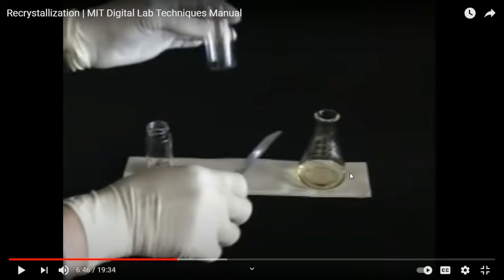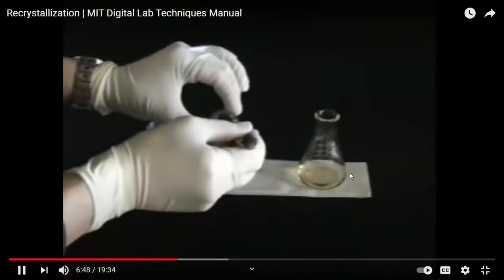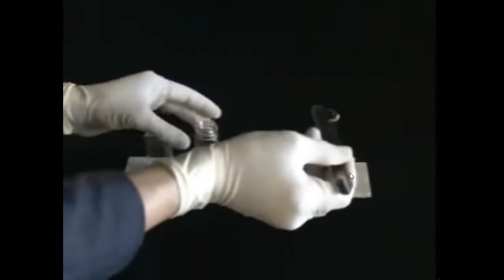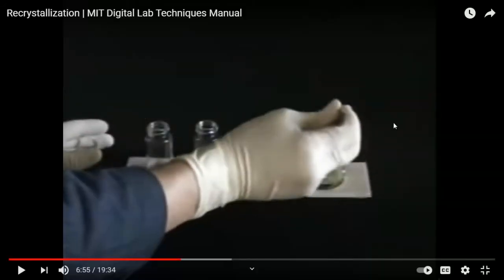Now, he will explain, hopefully. Let's see. Small amount of charcoal to absorb the impurity. Do not add too much or the charcoal will also absorb your compound. Yeah, that's exactly what I was going to say. The charcoal has a big surface area with good interaction with any compound. Okay, they don't have a brain, they don't have a sensor. They don't know whether that molecule is the colored impurity or the main compound you want to preserve. They don't know. They just take it.